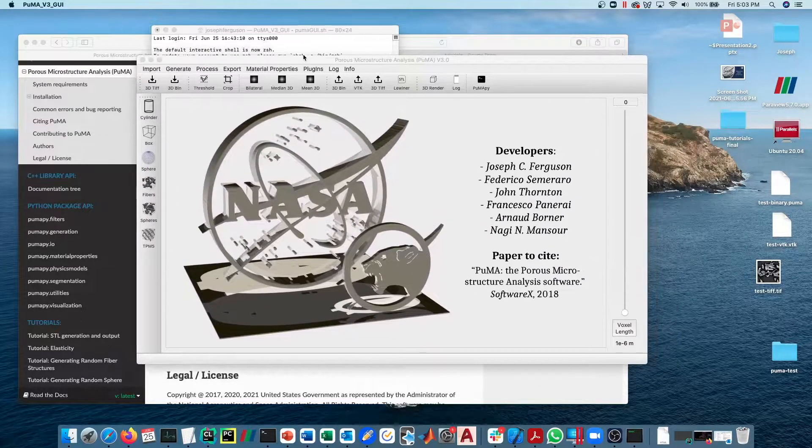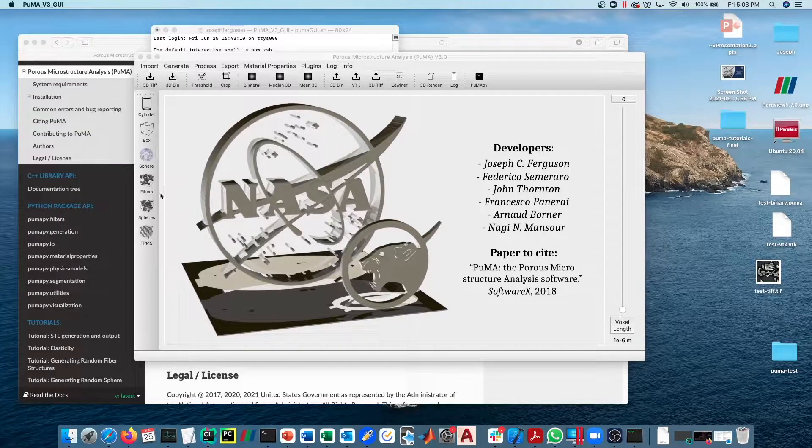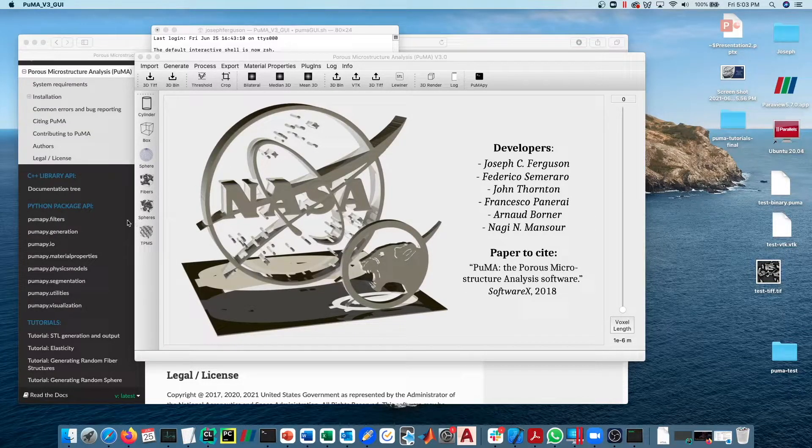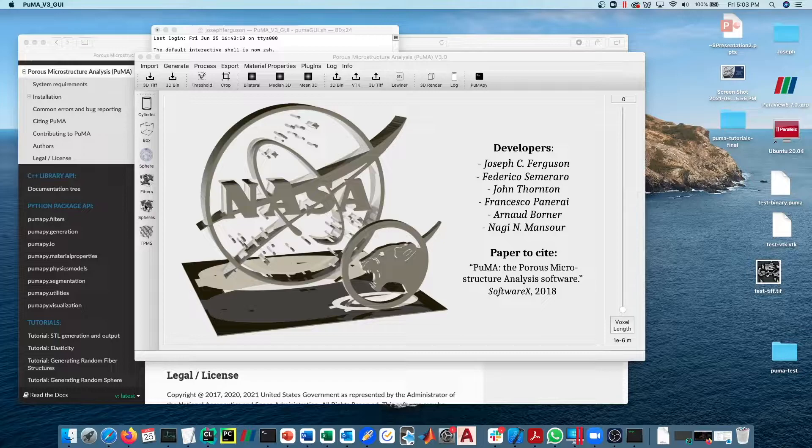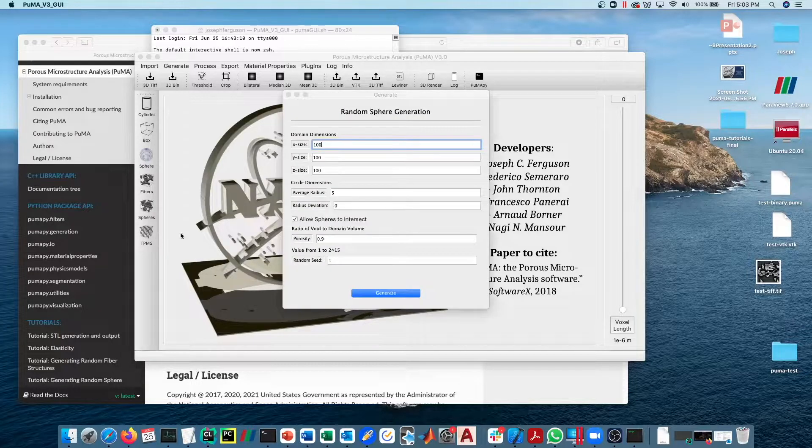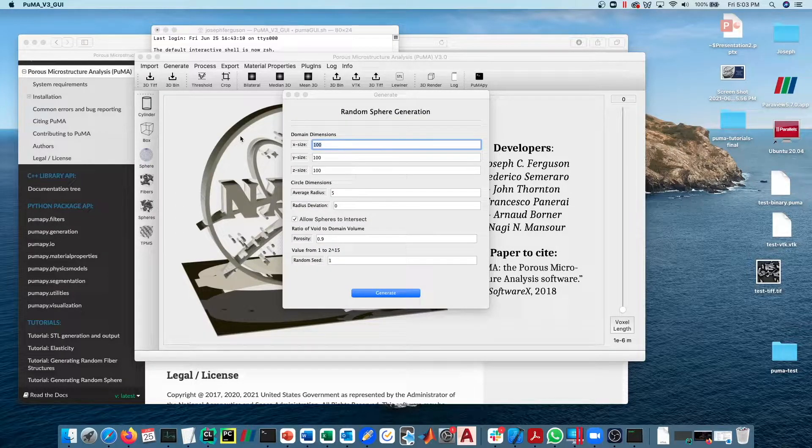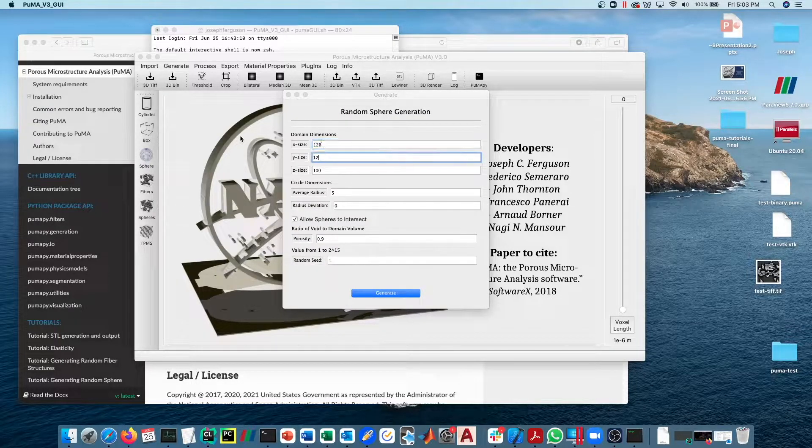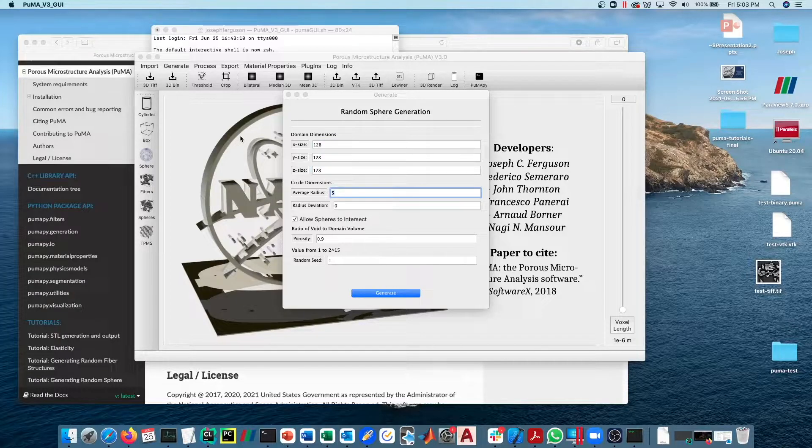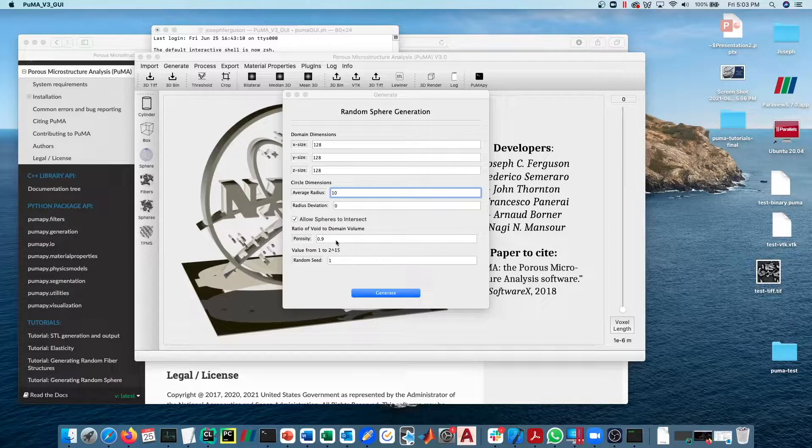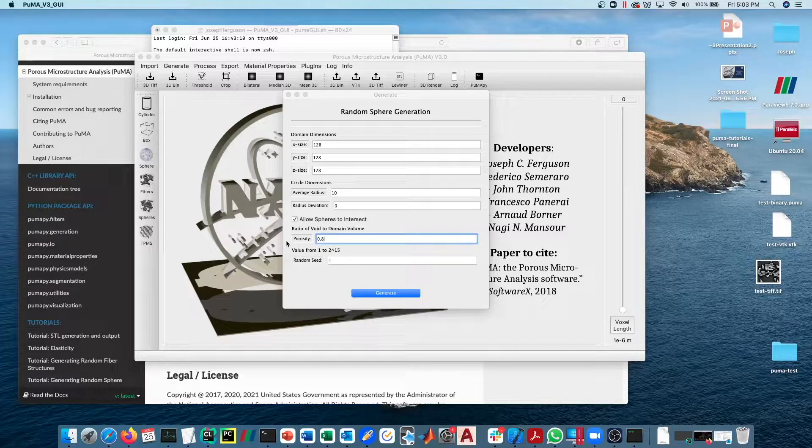The PUMA GUI will launch. You can run this on a tomography sample if you want. For the purposes of this tutorial, I'm just going to run on a randomly generated spherical structure. I'm going to generate it to be quite small, just 128 cubed with an average radius of 10 and a porosity of 0.8.